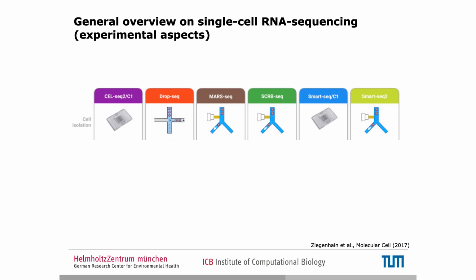and you want to know which of the cells has a certain FACS index, you would probably want to go with the MARS-seq protocol, the CEL-seq, or probably the SmartSeq protocol, because there you can sort the cells by index, and you keep additional information on the cells. However, if you sort cells by index, you usually use plates to sort them and to extract the RNA, and then you get fewer cells. That's one part. So how many cells can you get? What kind of information can you get from the cells?